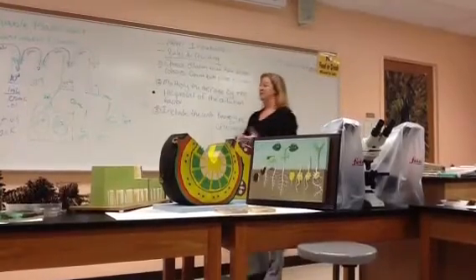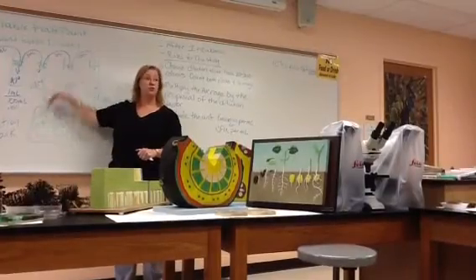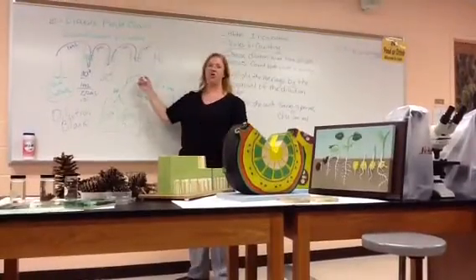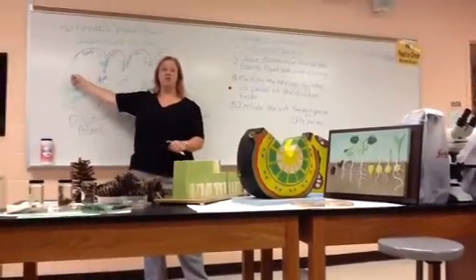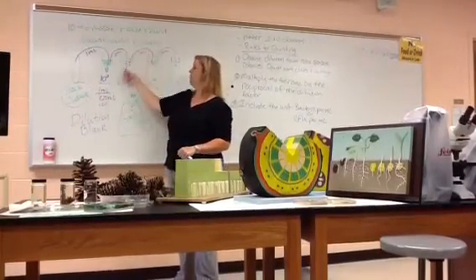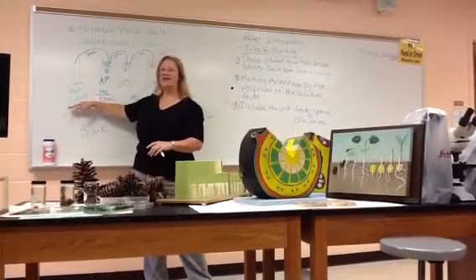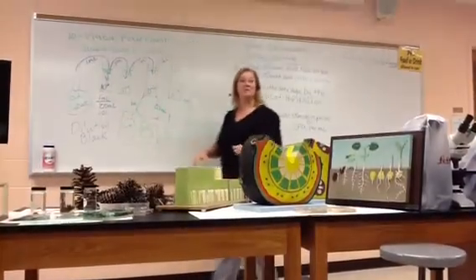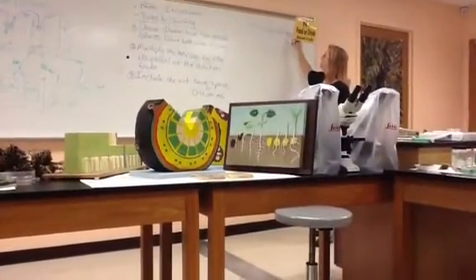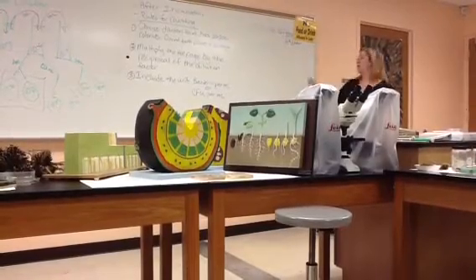What that tells you is that there were 167 colonies in this ml of liquid that you put on that plate. So that's all the bacteria you put there. That's wonderful, but we want to know how many bacteria were in the original tube. So now that we've got this number, we have to work backwards with the math, it's not that bad, to figure out how many bacteria were in the original tube. So when you actually do that count, that tells you how many bacteria were in the 10 to the minus 6 dilution per ml.